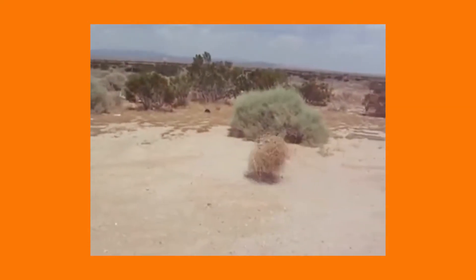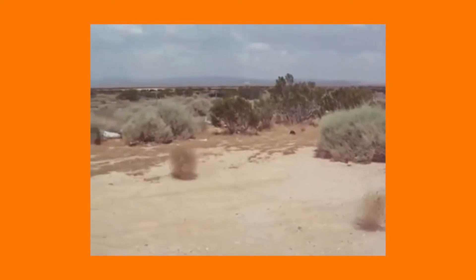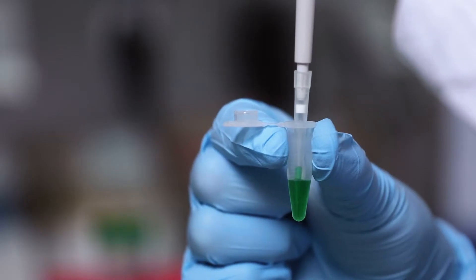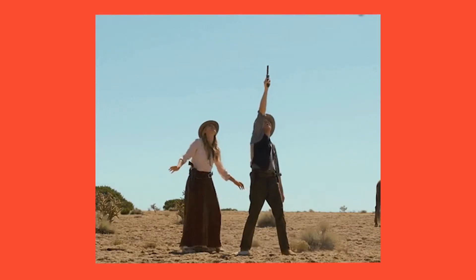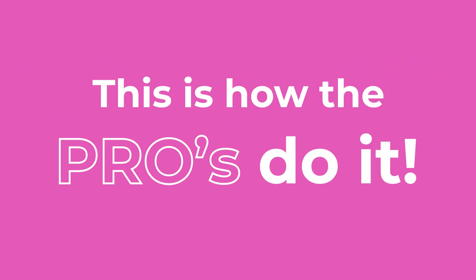Are your pipette tips dry as the desert before you start pipetting? Not good. Using a dry pipette tip to dispense your sample may be skewing the accuracy and precision of your results. Let's take a look at how the pros do it.